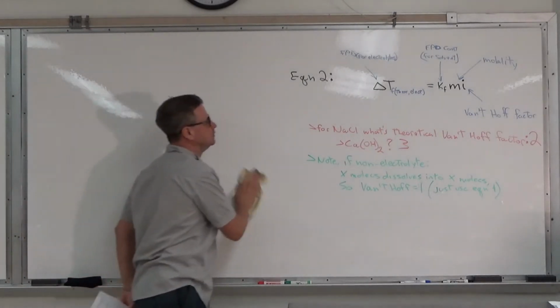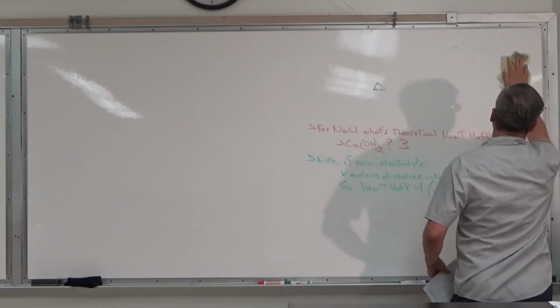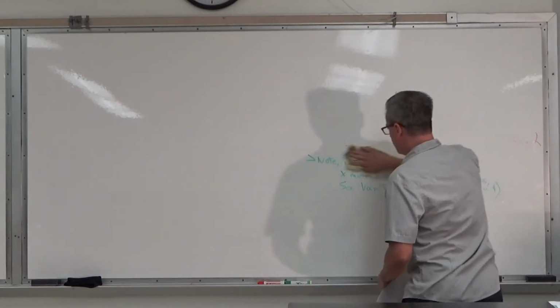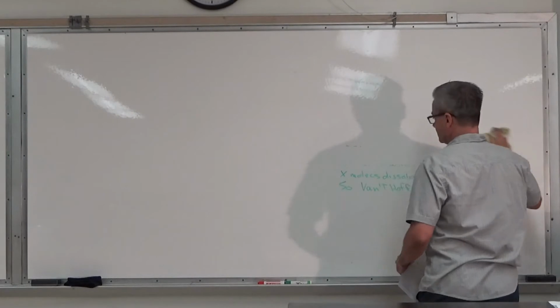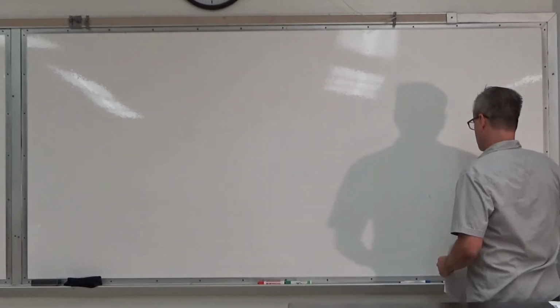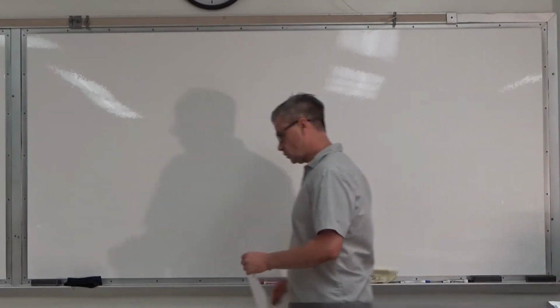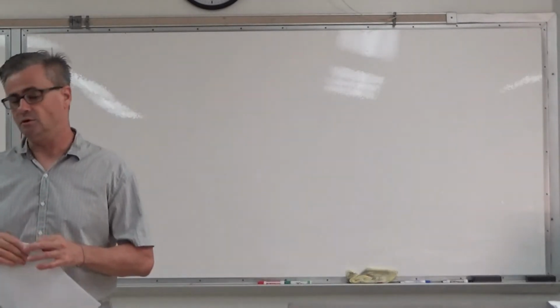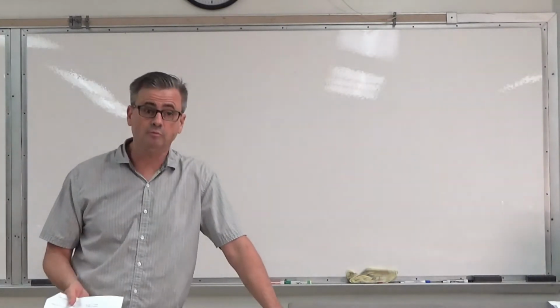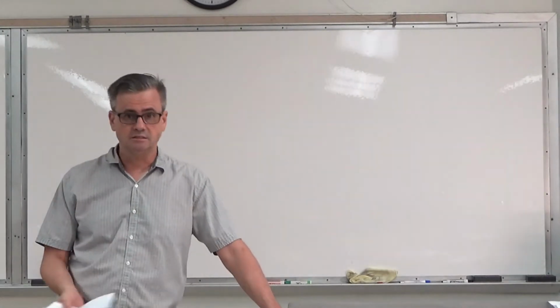All right. Now, as I said, sometimes the degree of freezing point depression experimentally is less than would be predicted with these formulas I just gave you, especially if it's more concentrated. So how would you determine the freezing point depression in an experimental situation? That's not too hard, actually.